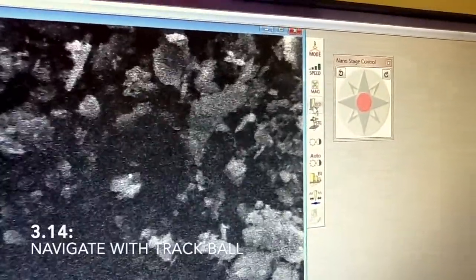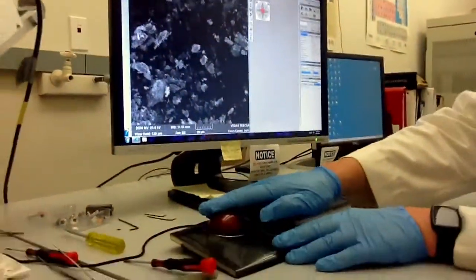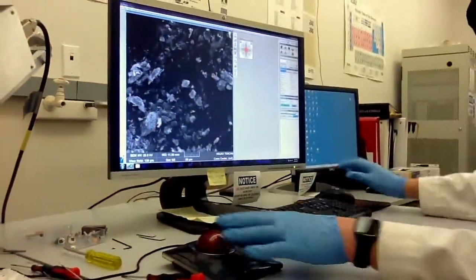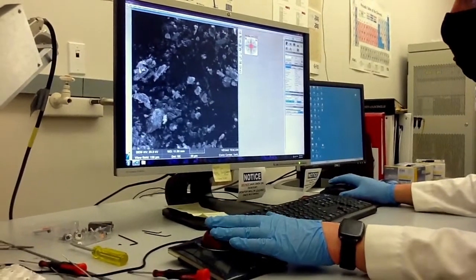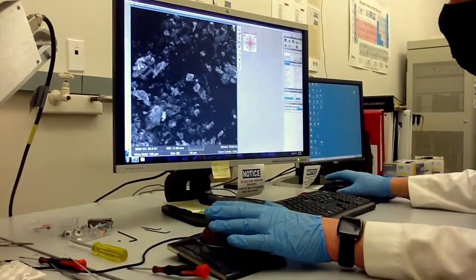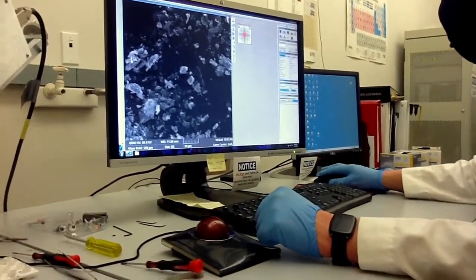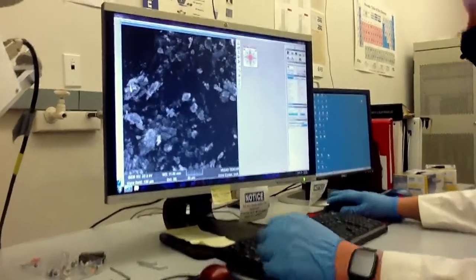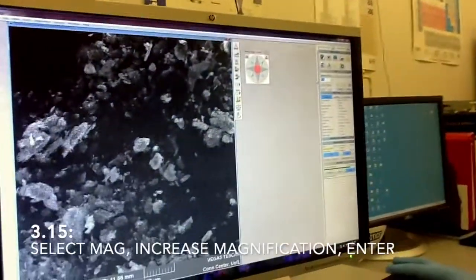For focusing, just make sure you check the working distance again and slightly adjust. At this magnification you may not see a lot of difference, so increase magnification — let's go to 5000. Then refocus. At this high magnification you may start to notice some astigmatism in the image.